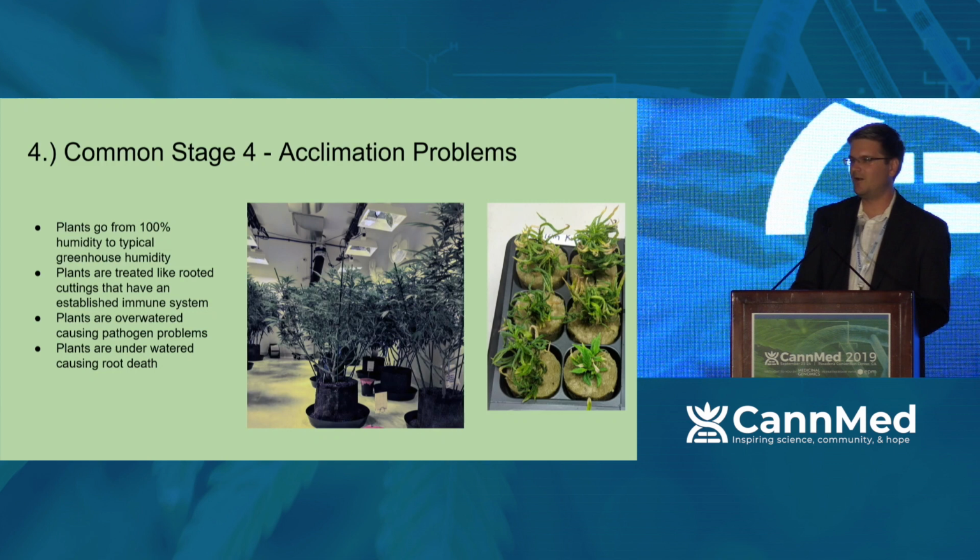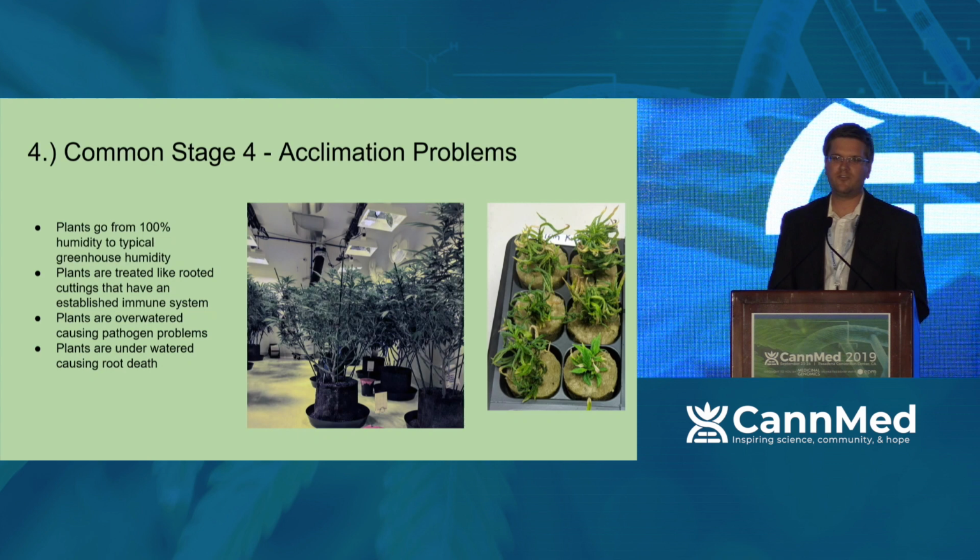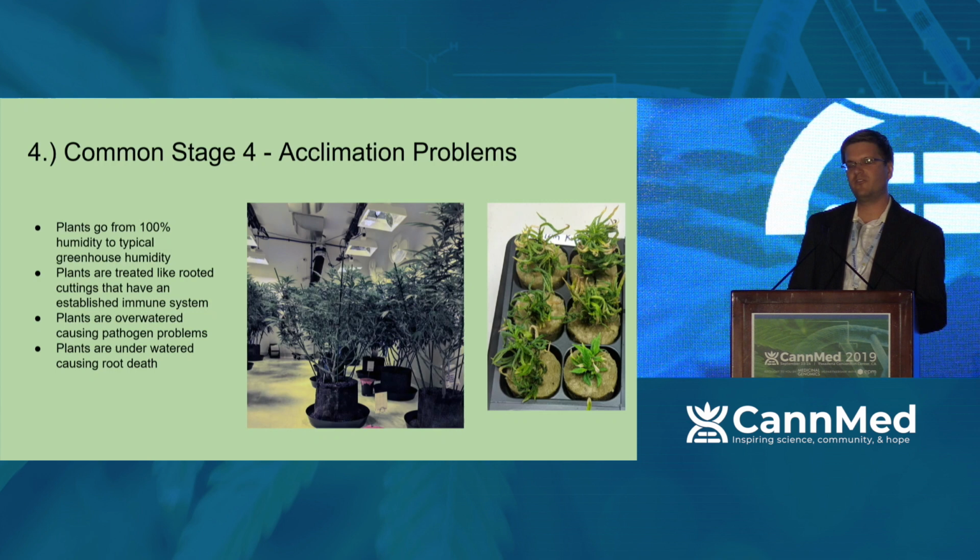I get the question a lot, how long does this take? Generally, the acclimation stage is that 2-week period. Sometimes it can go as high as 3, but once you start to see the roots grow, you know the plant's a lot more hardened off, and generally you can plant it at that point.